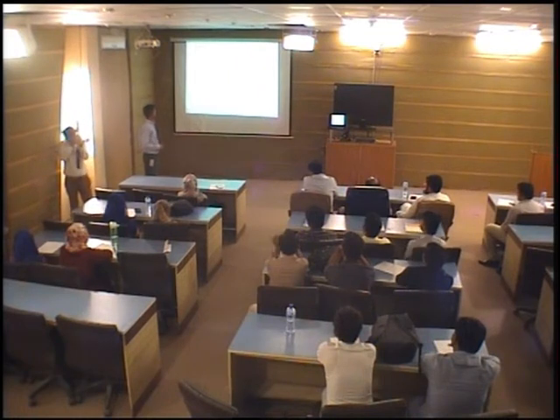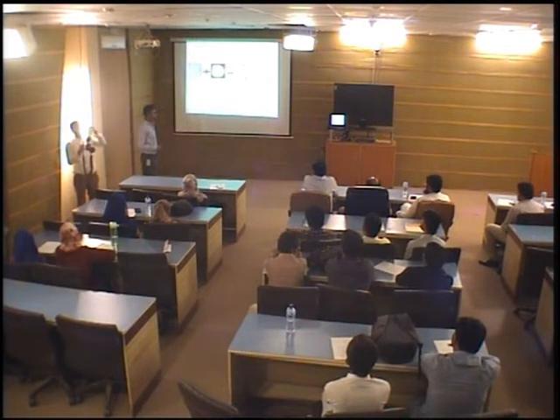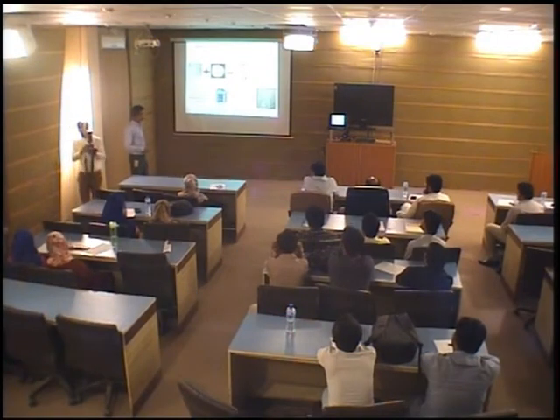Sample preparation. For sample preparation, we follow two steps. During step number 1, we take 10 gram of cosmetic mixed with 3 gram of wax powder using a mixing machine. And finally, in the second step, we use an electrohydraulic press, and finally our target samples are ready for analysis purposes.